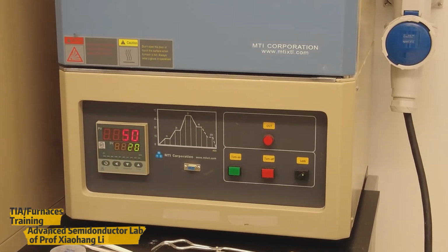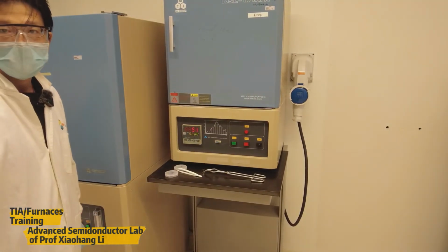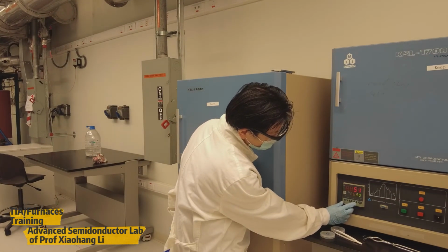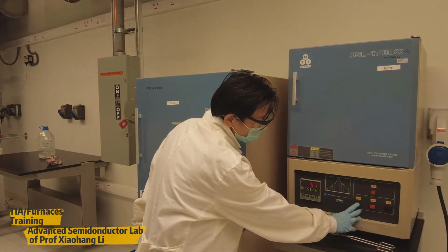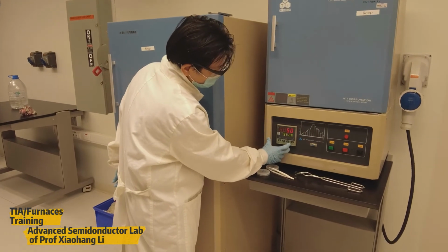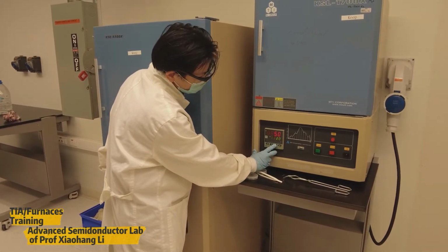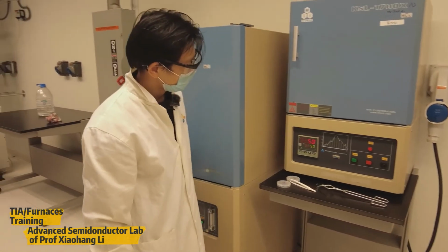Okay. After we finish the setting, we will start the program. This is the run button. We have to make sure you already pushed turn on to enable the heat power. And then we have to long press this button. Okay.